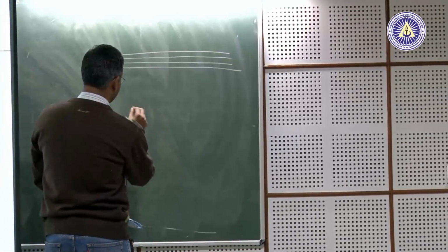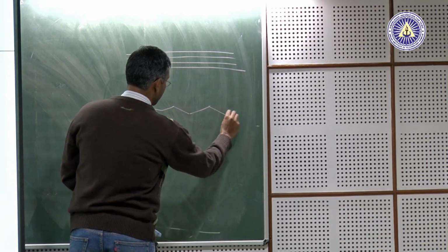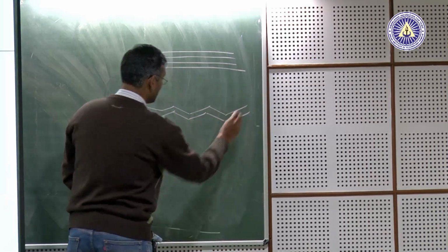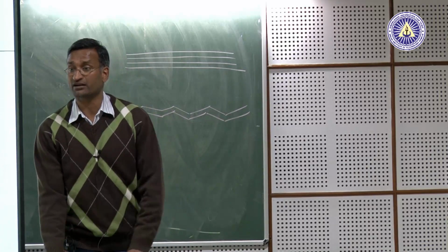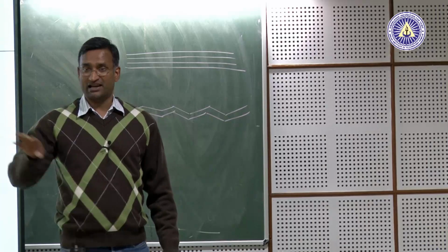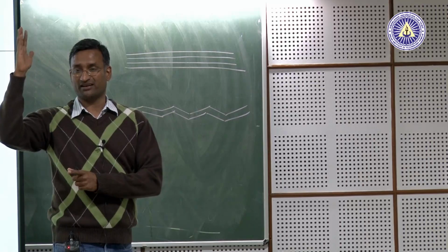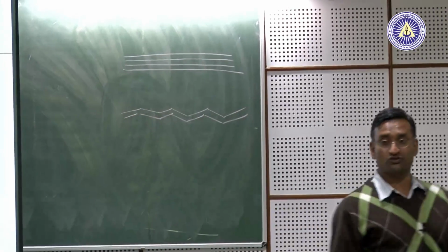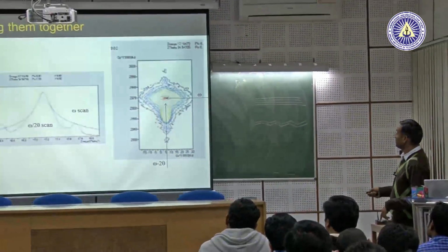But in a non-ideal case, you will have a thin film where you have planes at various angles to the surface. If you rock this sample, you will be able to capture all those planes which are inclined to the surface by a tiny degree. Remember, it is not for planes which are perpendicular to the substrate or at very large angles. It is only for a very tiny variation in the misalignment, maybe about 0.1, 0.2 or 0.5 degrees, certainly not more than 1 degree.